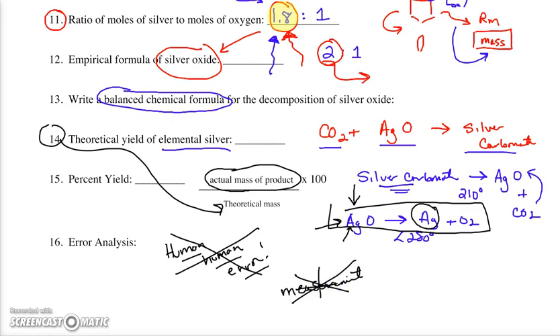I want to think about what could have happened in the lab with this crucible that may have, you don't know for sure, but give me very, very good sound logic of why you're under, and carry the math through. The one way to think about this college level error analysis is carry the math through to see how it would lower the value. Okay, hope that helped.